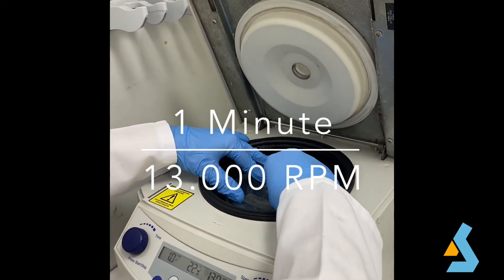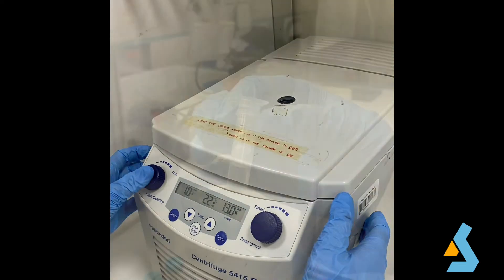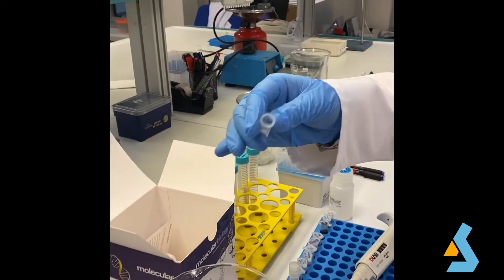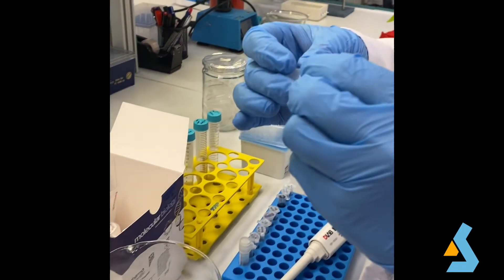The tube is centrifuged for one minute to bind the DNA to the silica membrane. After centrifuge, the bottom of the spin column tube is poured and the column is placed back into the same collection tube.